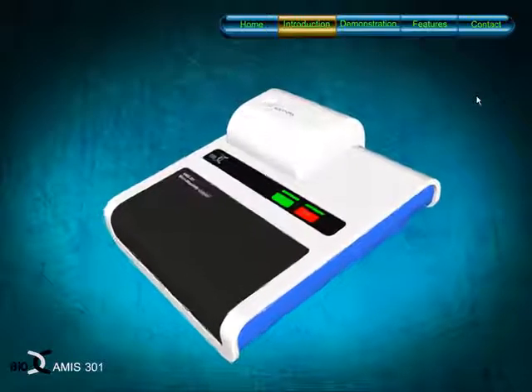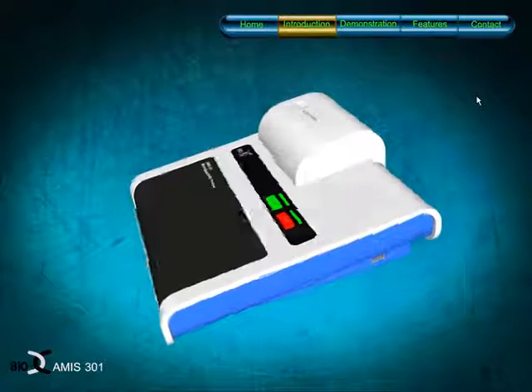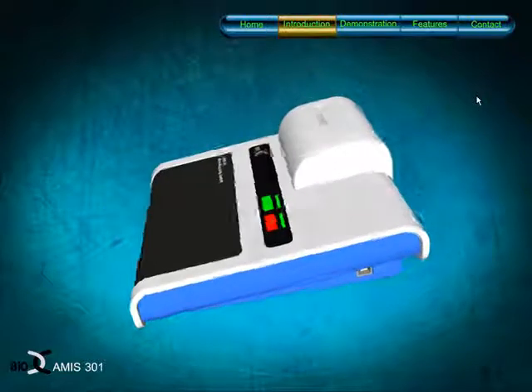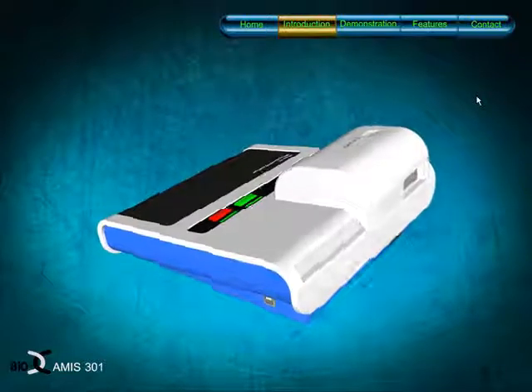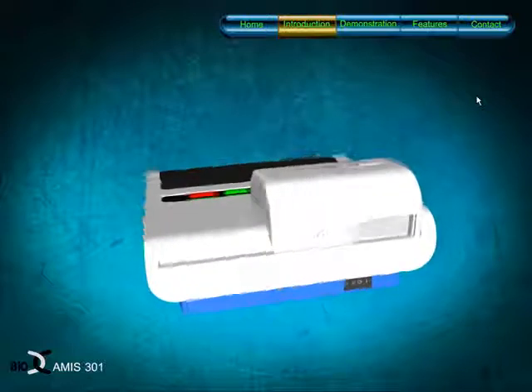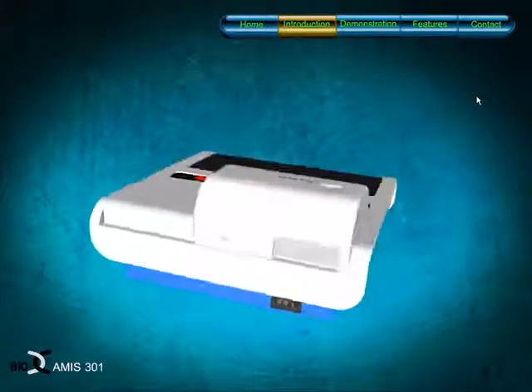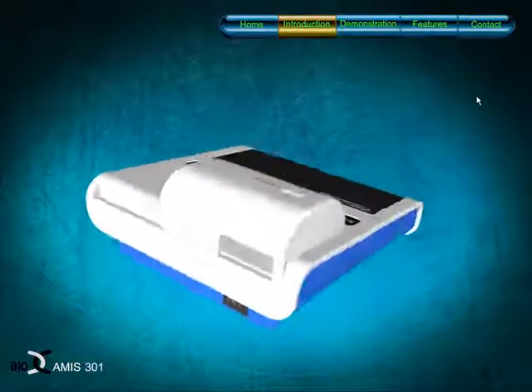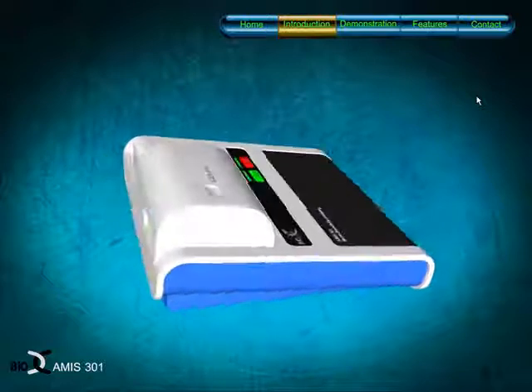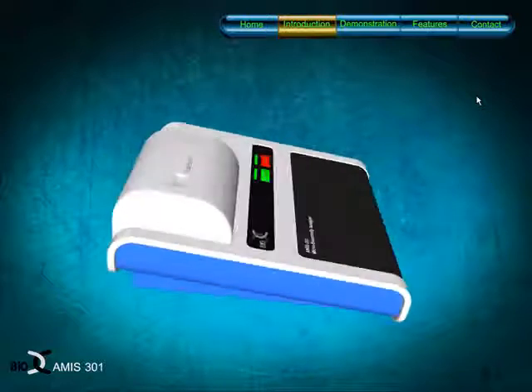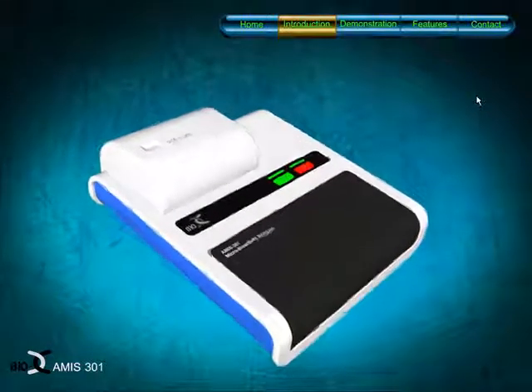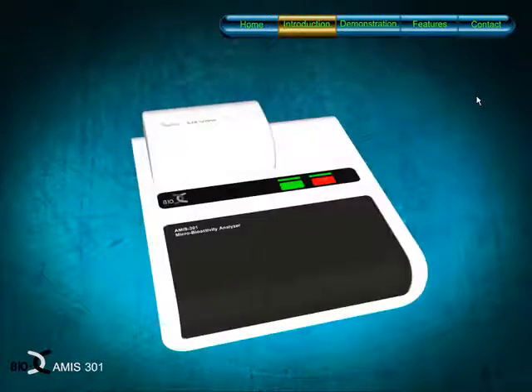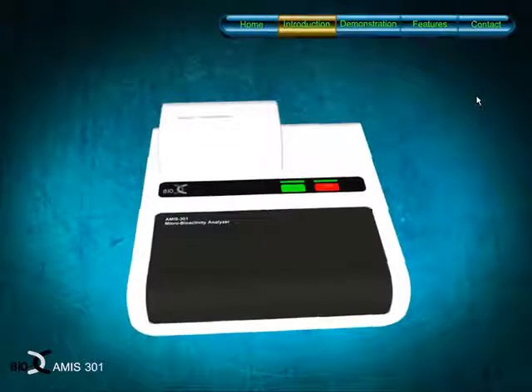The Microbioactivity Analyzer uses an ISFET transistor to directly sense proton changes from a chemical reaction. In addition, we create a highly specific biosensor by using enzymes as a reagent. Before we demonstrate how tests are done, let us show you the analyzer.